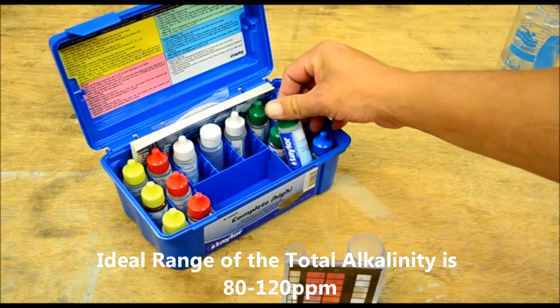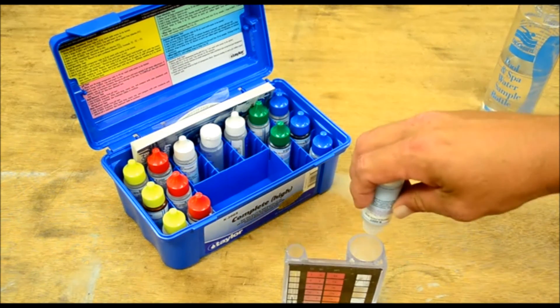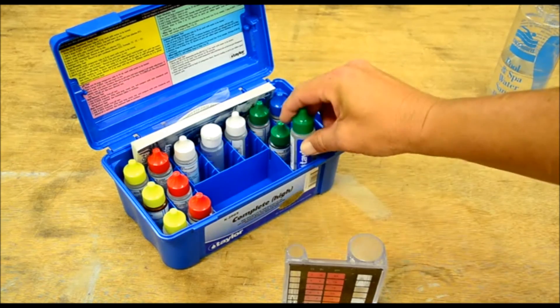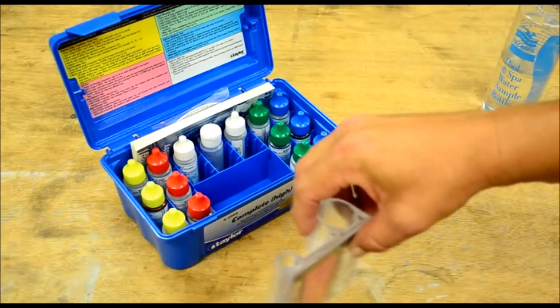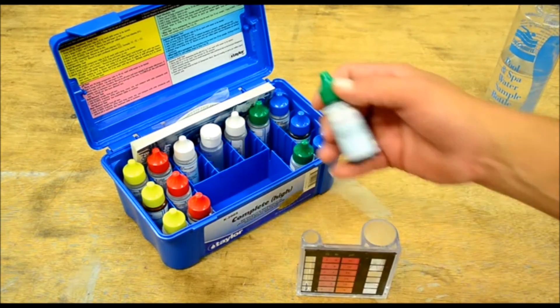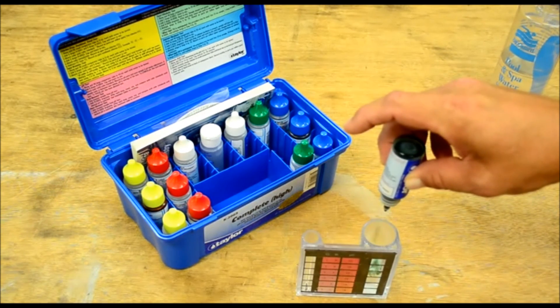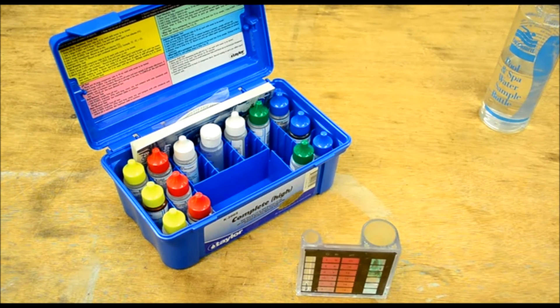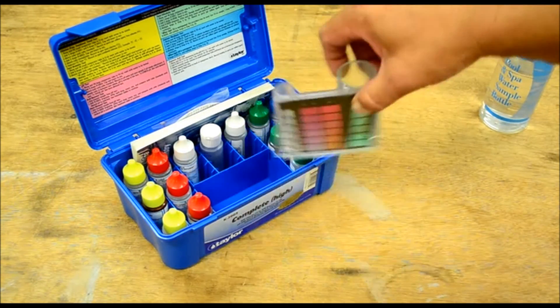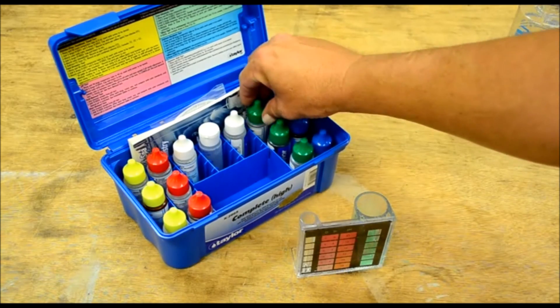We're going to start with reagent number seven — put in two drops, remembering to hold the bottle straight down to get the best amount of reagent. We don't need to cover this, just swirl to mix. Then we're going to grab reagent number eight and put in five drops of that, swirl to mix. As you can see it's turning green.